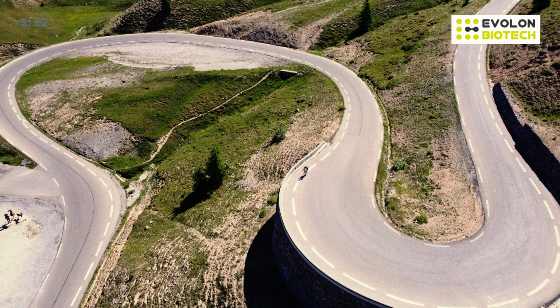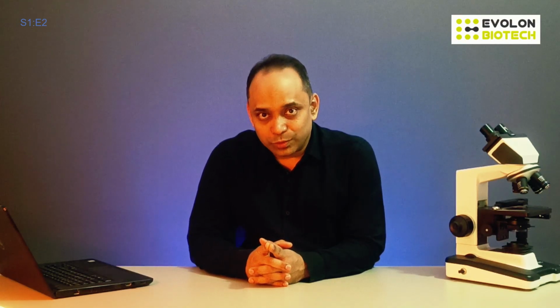So, initially, let's focus on your vehicle and the road will take care of itself. When you observe bacteria under microscope, you now know that the movement alone does not define whether they are alive or active. Look at other indicators of activity like cell density, flock structure, and so on. We are going to study flocks in our video number 7.